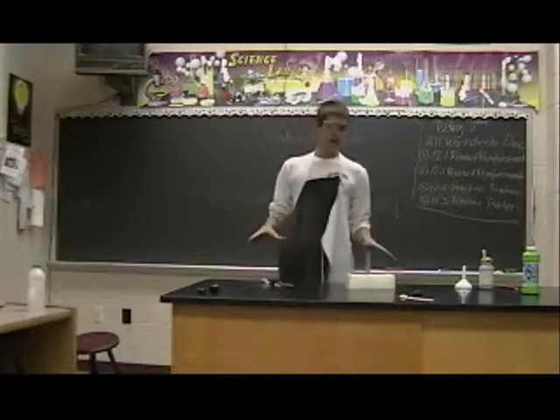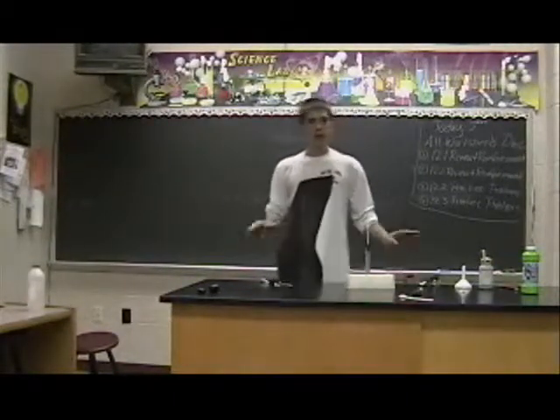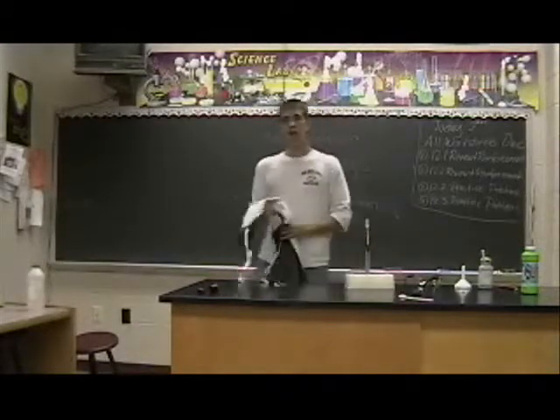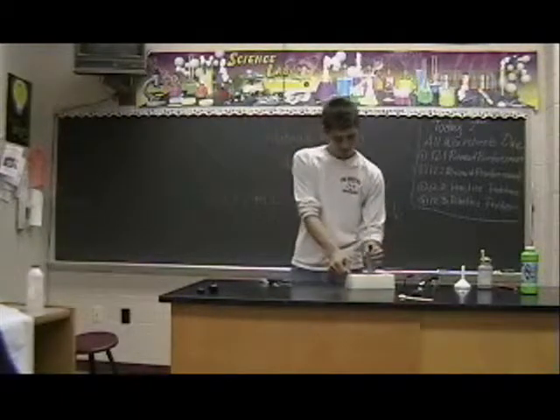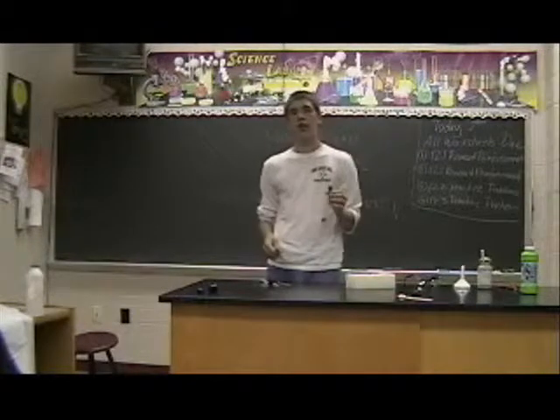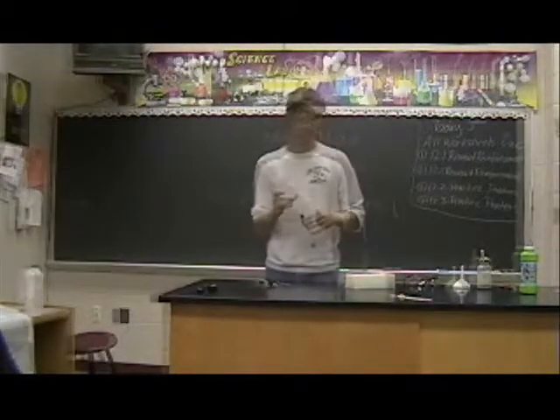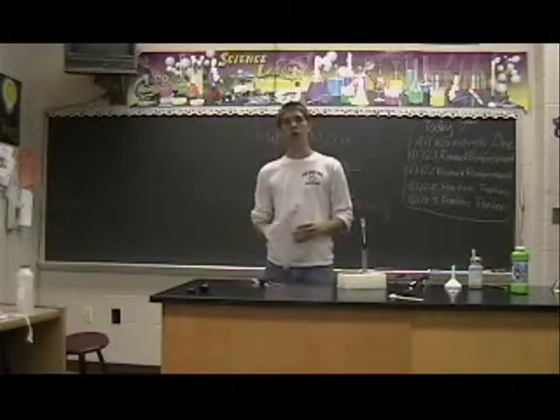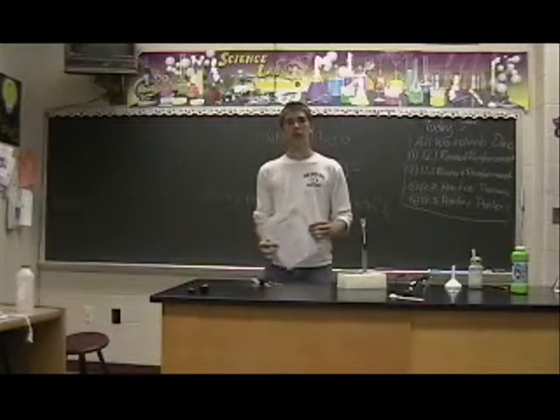Finish with the lab. Make sure everything is cleaned up. All your utensils and working objects are put away and cleaned. Take all your stuff off. With the remaining substance in the test tube, make sure you give that to your science instructor so she can dispose of it properly. Then complete your pre-lab questions, your post-lab questions, and your observations. And remember to have fun with all of this stuff and be safe.